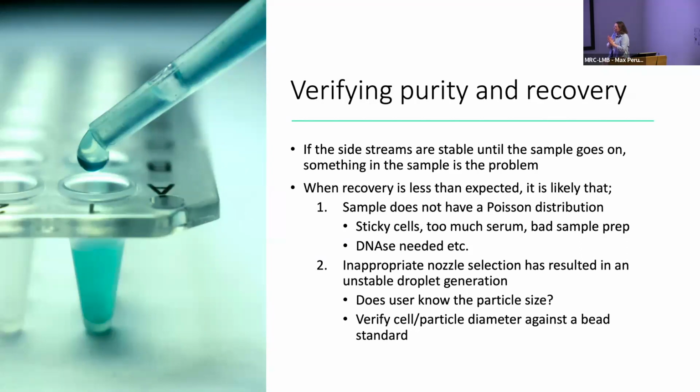One of the things that we do to try to mitigate that is to make sure, if your cells are rapidly dying, maybe add a little bit of DNase to the media. If there are sticky cells, make sure that you're adding maybe a little bit of EDTA.